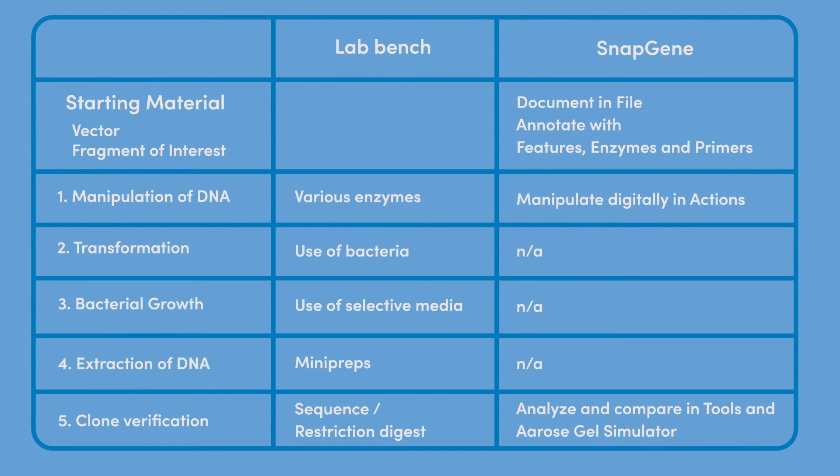In this final table, you can see how SnapGene functions align with your lab bench workflow. The File menu allows you to create DNA documents. The Enzyme Features and Primers drop-down menus allow you to add custom annotations to your sequences so that you can create a complete map of the elements in your sequences that are important to you.